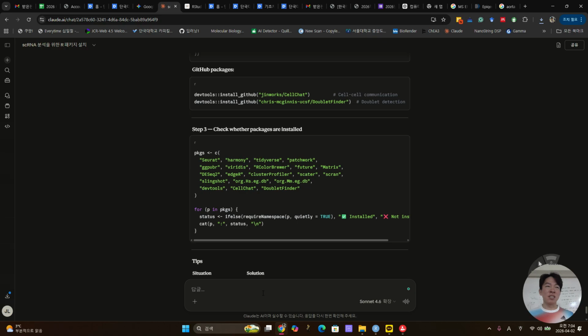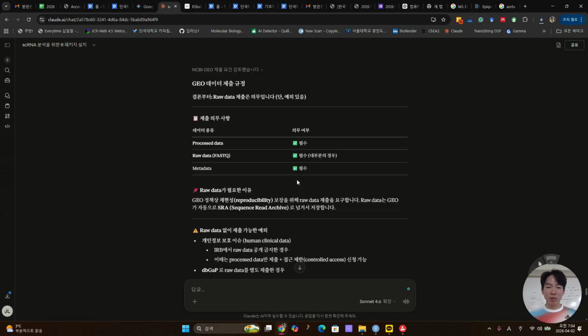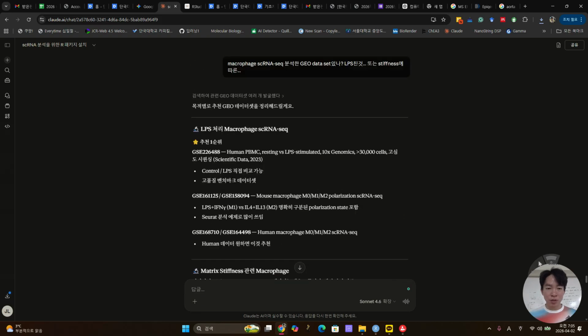So, today after installing all of this, I want to analyze this system. Today, for the first time, I analyze this data.